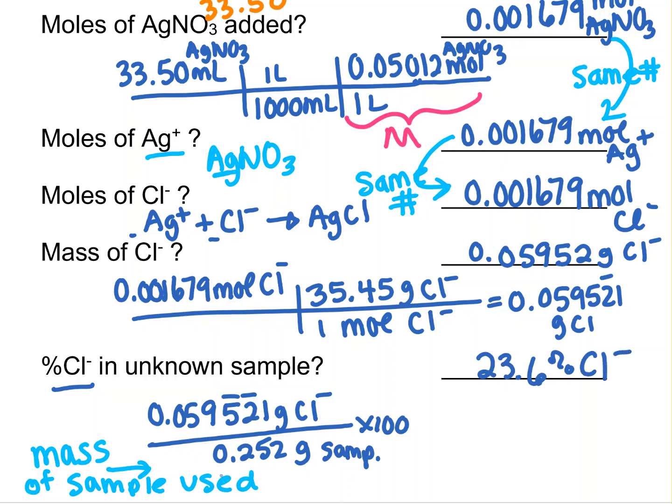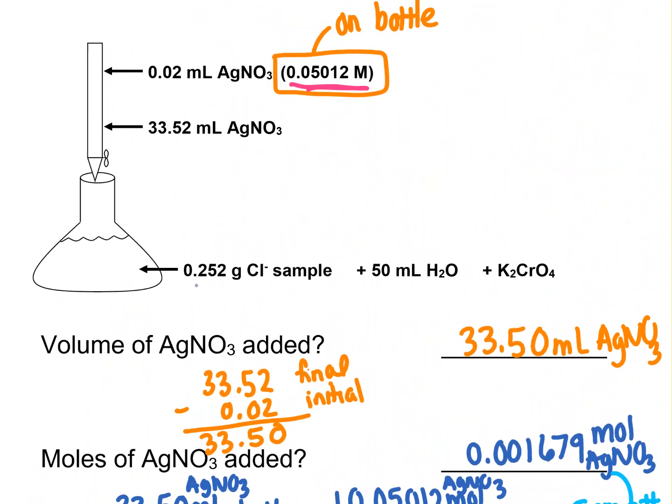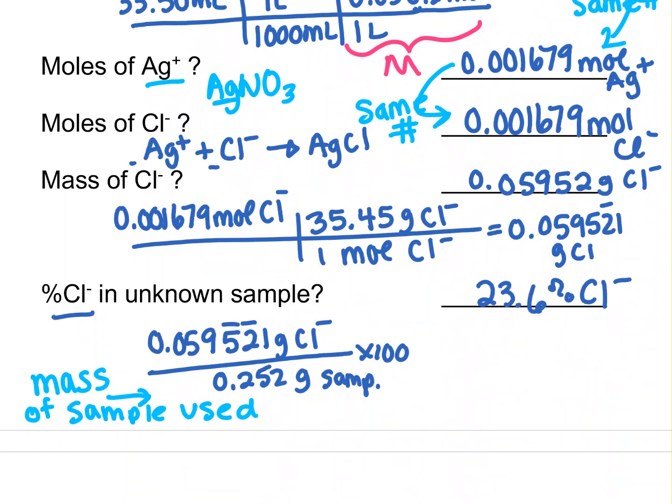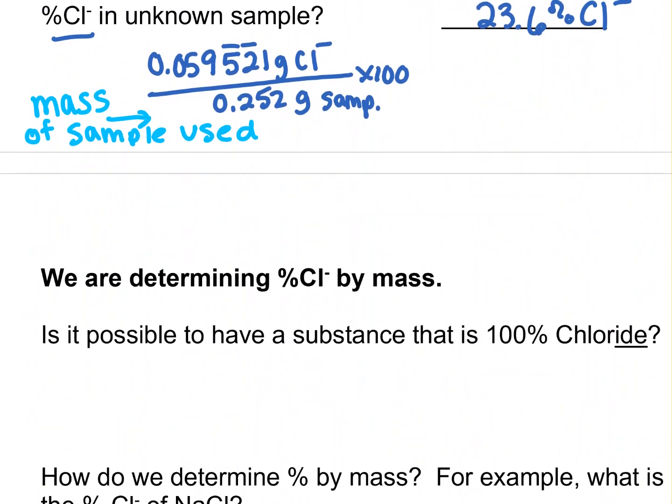Okay, I'm going to show you where I got that number, just to remind you where that comes in. It was the amount of the white powder that we put into that particular flask. This amount will be different each trial probably, so you'll need to keep track of which one, but that's the end of the calculation. Now I've got a little bit more notes to help with some of the post-lab stuff as well.